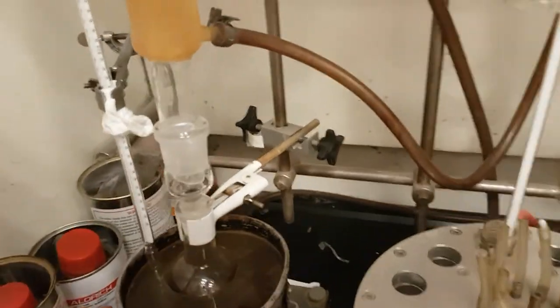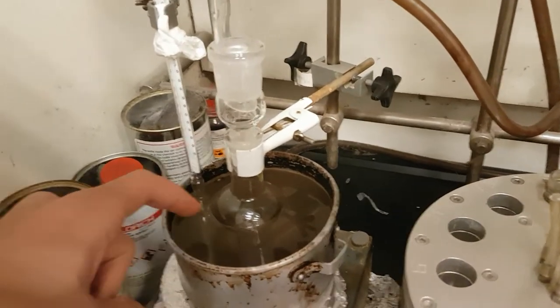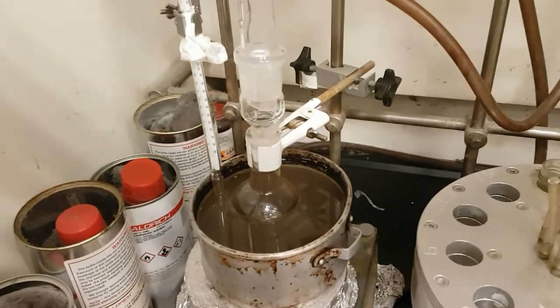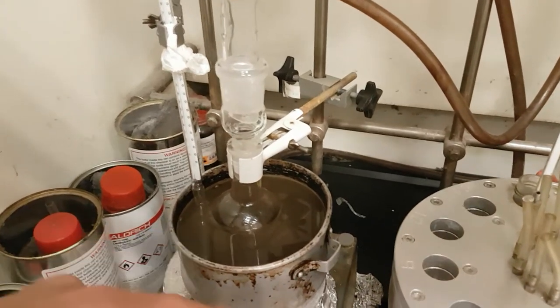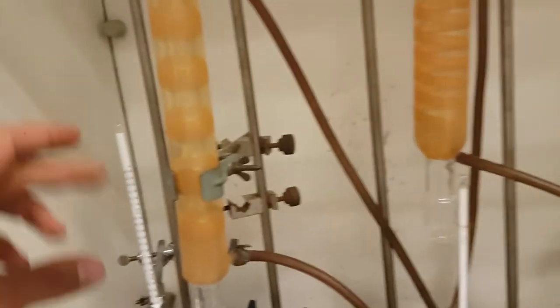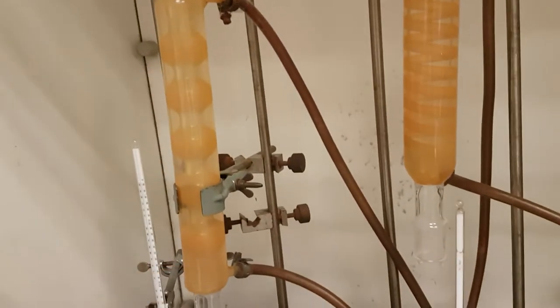We are putting the flask inside vegetable oil, because it makes the distribution of temperature easy — uniform temperature outside of the flask. And here we have a condenser, so the solvent goes up and down continuously. Normally we need only about six hours to make this kind of reaction, but after that you can use a TLC — you can spot your products to see if your substrate is finished.